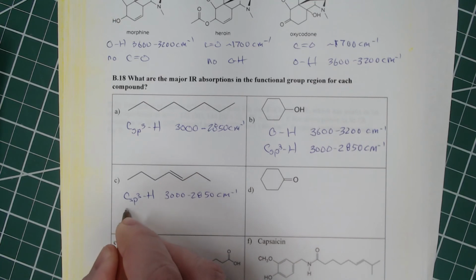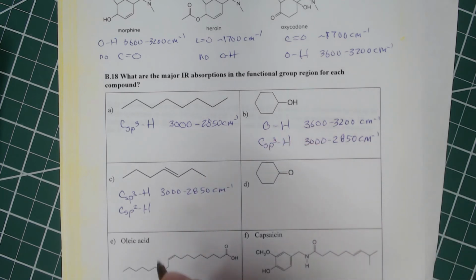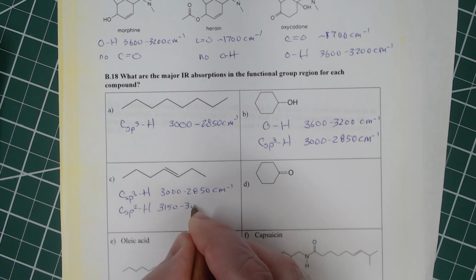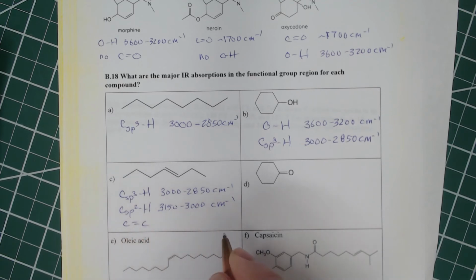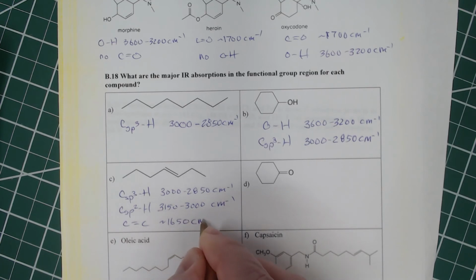All right, we've got carbon sp2 hydrogen because there's hydrogens here and here. And those are going to be 3,150 to 3,000. All right, and then we've got that carbon-carbon double bond that's going to show up at about 1,650 centimeters.